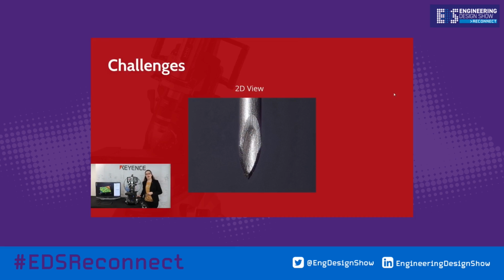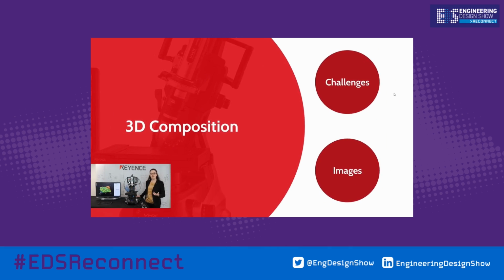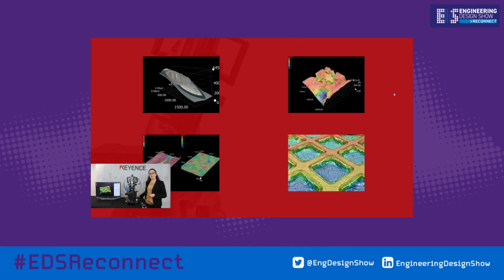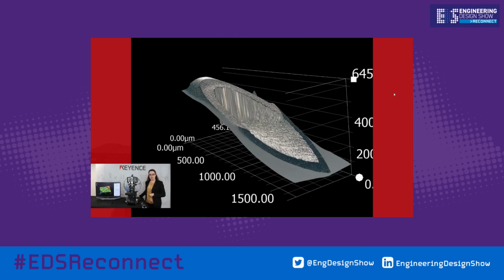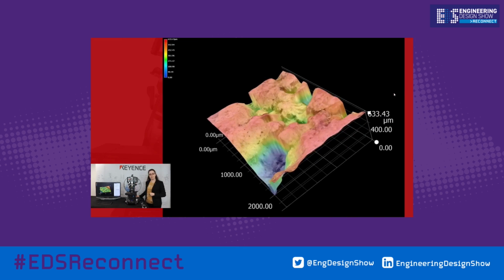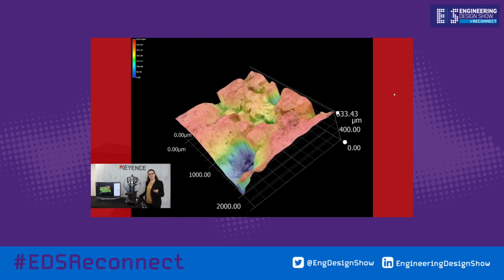Just to go into a couple more examples of how this can be used, I've got some more images. So first of all, we were just seeing the 2D image of the needle. Here we've got a full 3D rendering of the tip of the needle. So we can now really clearly see the surface texture on the inside of the needle, as well as the actual shape of the top of the curve of the needle. Here, not quite as interesting, this is concrete. You can see the pits where the blue sections are and the raised sections where the red is, just to get the overall surface texture of the concrete.